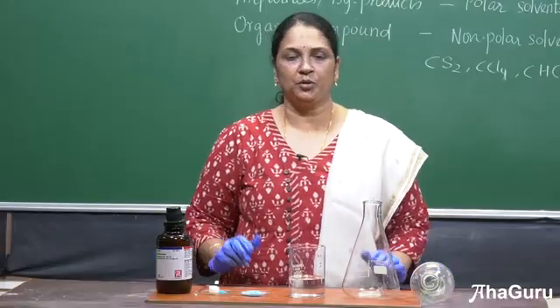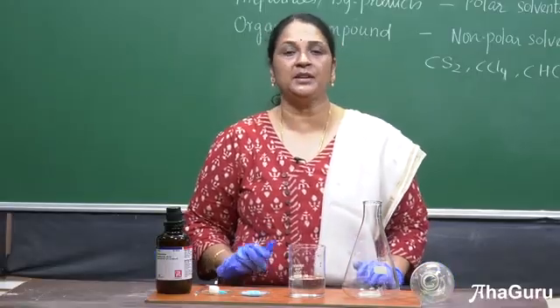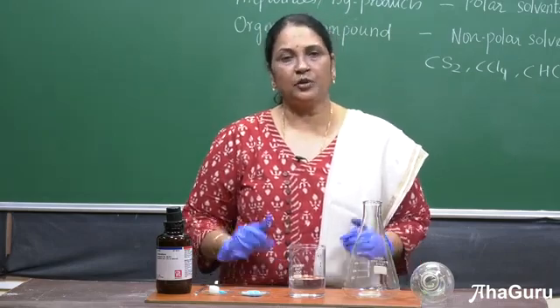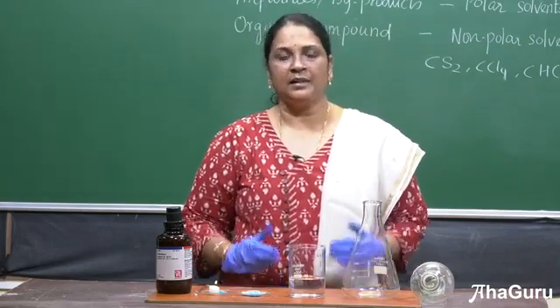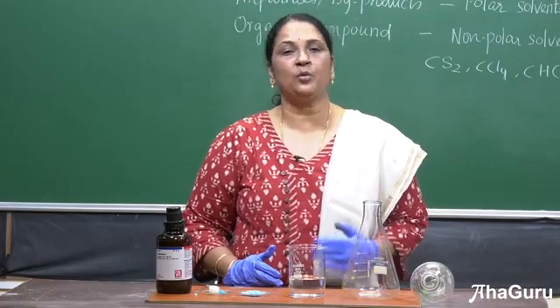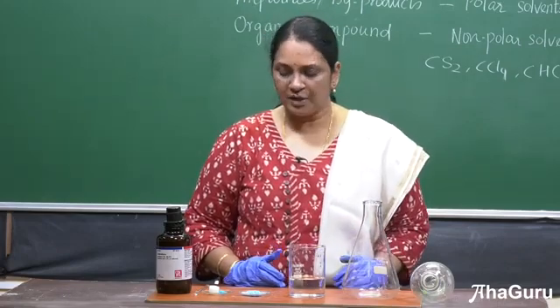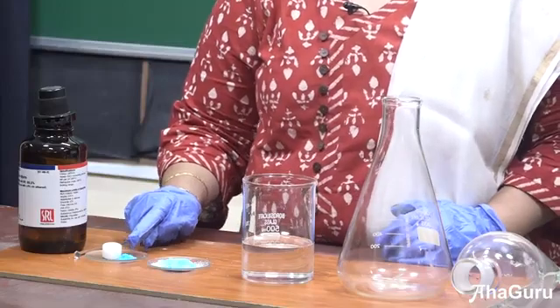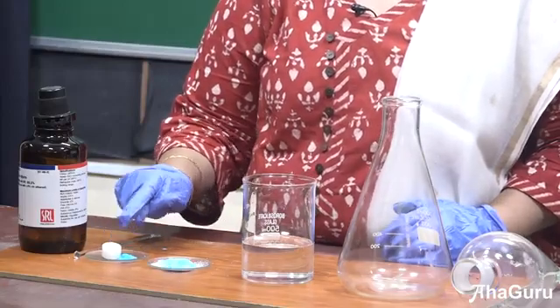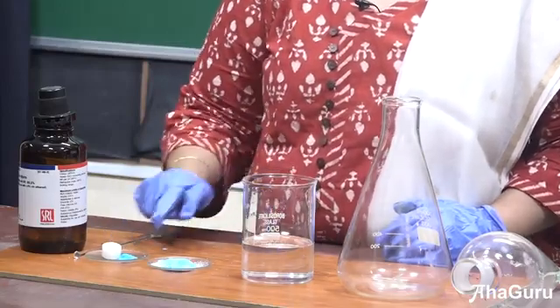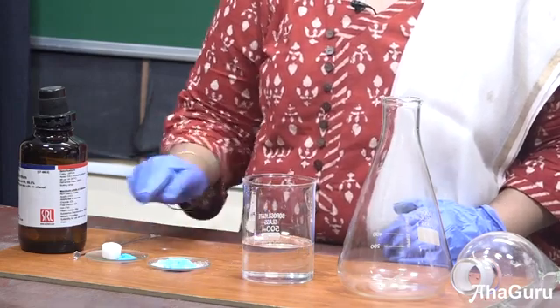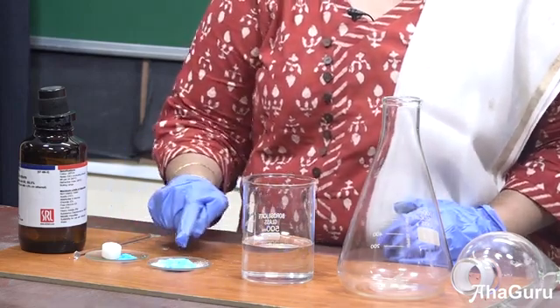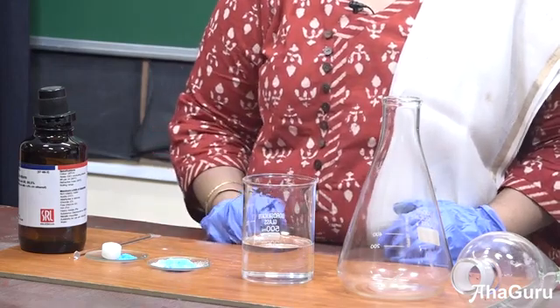I am going to show you a small experiment based on the differential extraction method using a separating funnel. We use this method to separate polar and non-polar compounds. For experimental purposes I have taken two compounds: one is naphthalene and the other is copper sulfate. We know that copper sulfate is polar and naphthalene is non-polar. I have made them into a powder and taken this mixture.